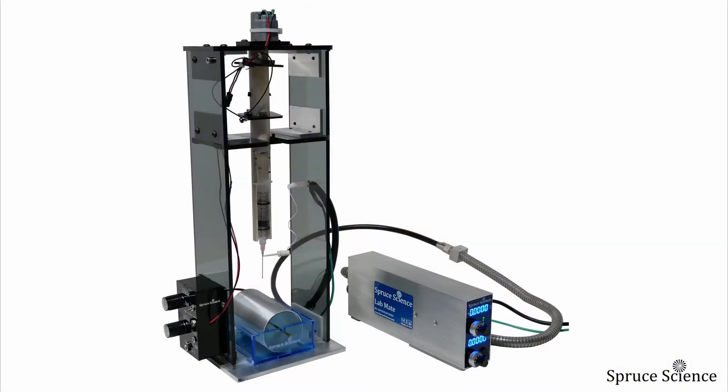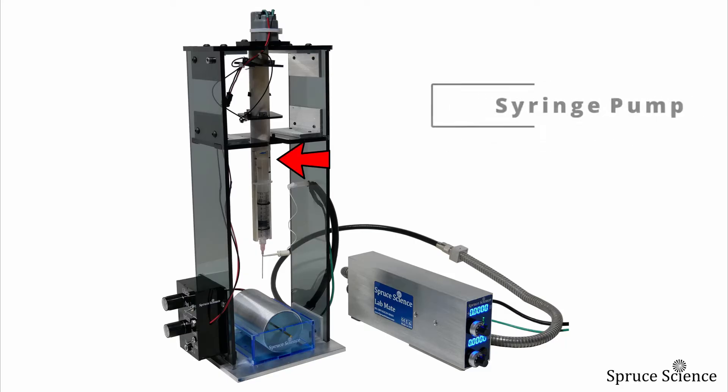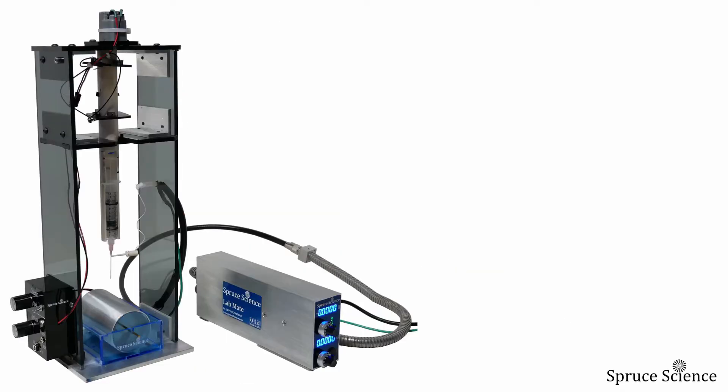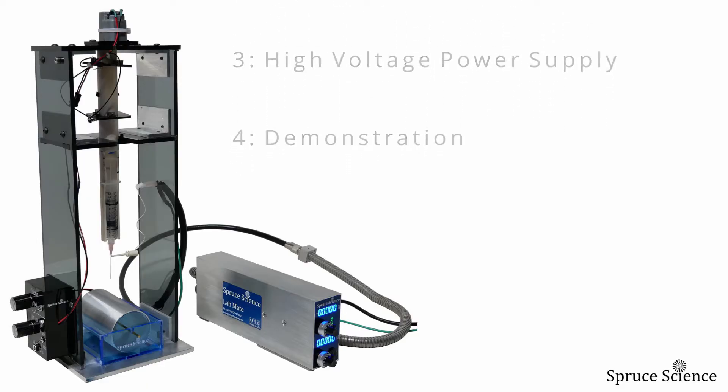The apparatus used in the electrospinning process is shown here. The hardware consists of high voltage power supply, syringe pump, and collector assembly. In the rest of the video, I will go over each sub assembly and demonstrate how the electrospinning machine operates.